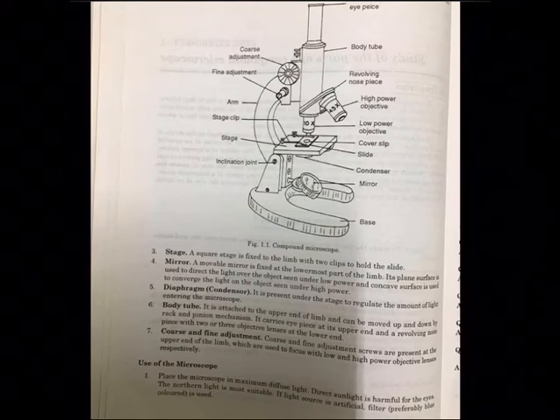This is the practice that you need to do. Up to class 10th, okay, I have observed you closing both the eyes also. But at least now you must open one eye and slowly open both the eyes. What is the advantage? When both the eyes are open, with one eye you can see through the eyepiece and see the object, so that you are able to see properly. With the second eye, you can keep your practical notebook, a small 50-page notebook, and draw the diagram. What you are seeing under the microscope, you can draw it. That is the purpose why both the eyes should be open.